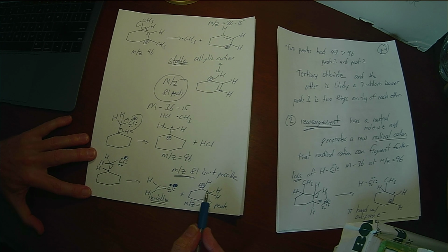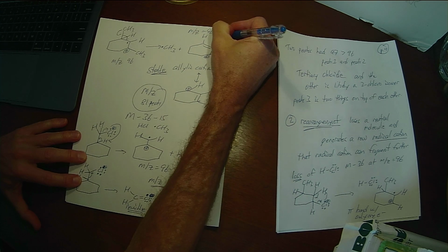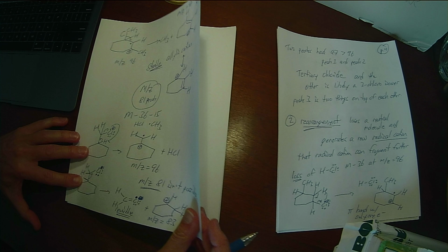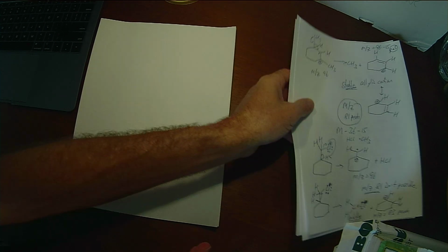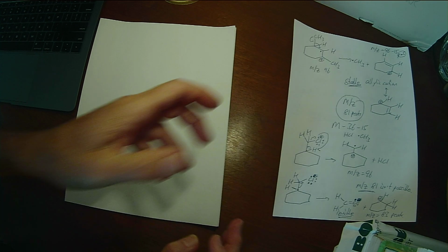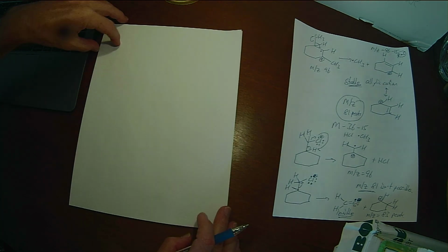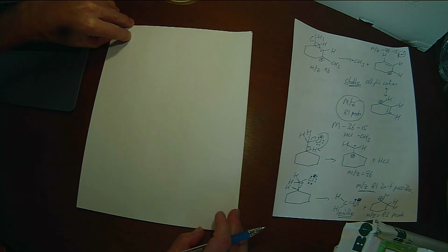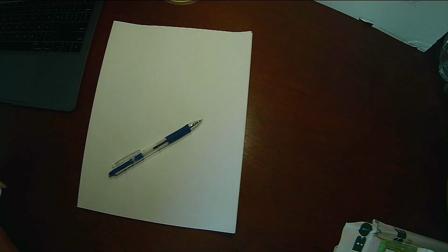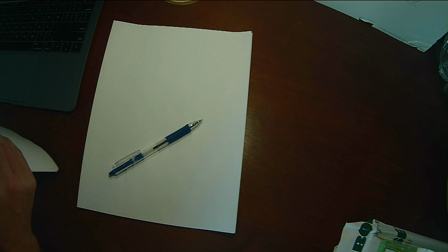So the fact that we see this peak and we can't see the loss of methyl, right? That's pretty distinctive for the primary. So which peak was the primary? Emma, I think you already figured it out, didn't you? You may be the only one that's actually looked at the data yet. So, yeah, I got that peak 7 was primary.